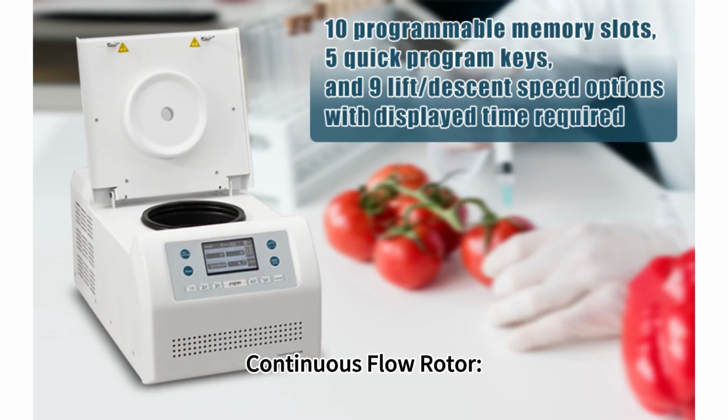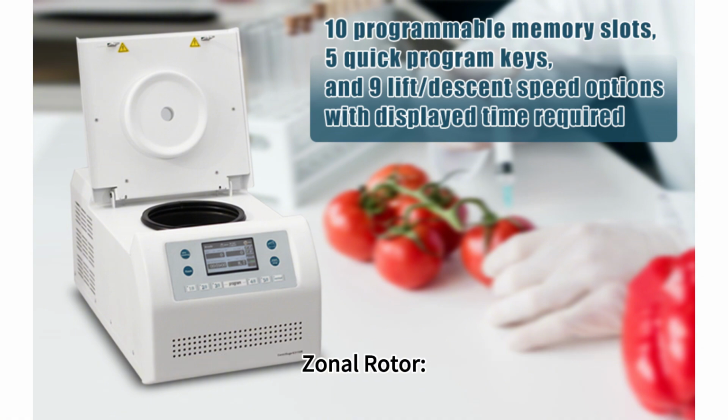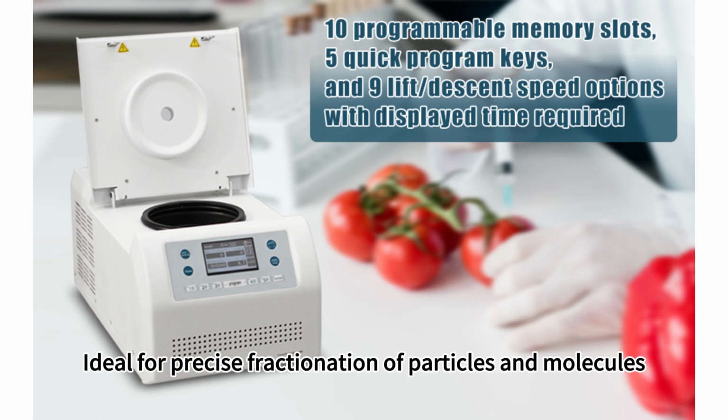Continuous flow rotor. Description: samples are continuously fed into and out of the rotor during operation. Suitability: best for continuous processing and large volume separations. Zonal rotor. Description: samples are separated based on density gradients without physical barriers. Suitability: ideal for precise fractionation of particles and molecules.